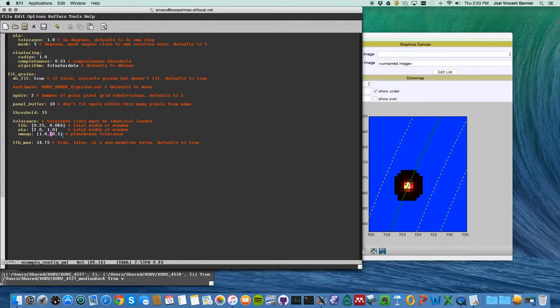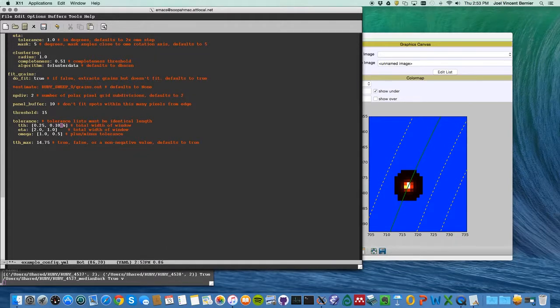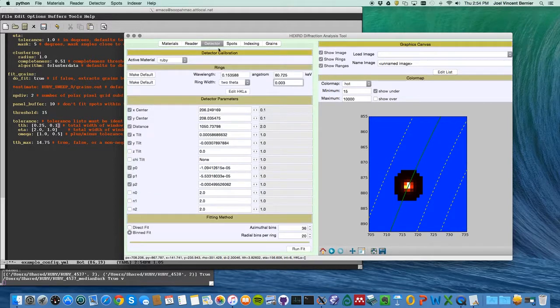So again, we'll just half the tolerances there. So a wide sloppy one and then the one that's on the peaks. Now the 2 theta tolerance, if I look in here, what's that? 2 theta is 3.65, and up here it's 3.75 roughly, so that's 0.1. To go that small, so I can say 0.1 here. 0.25 is plenty. 0.25 I think is the tolerance I have marked by these lines here, if I am not mistaken. It's 0.3. Okay, so 0.25 is like from here to here.